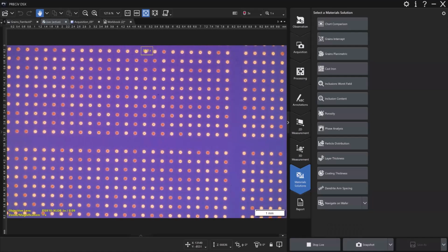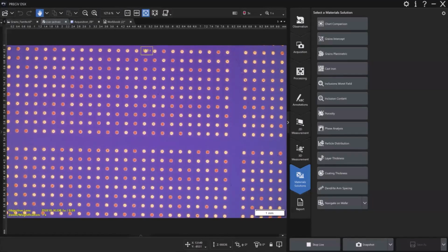And bring it into focus. This wafer doesn't have any real unique patterns. It's a demo wafer. I can't show anything with real circuits on it, but it's got some dots and patterning on it. And I created the navigate on wafer based on this wafer pattern.